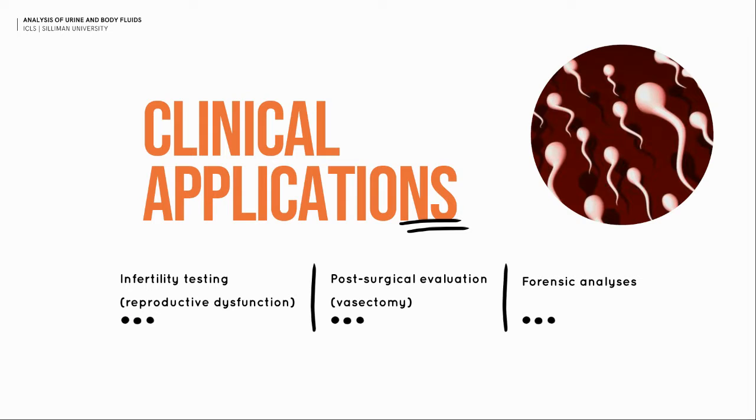So the first one, clinical applications. The first clinical application is infertility testing. This is for couples who want to conceive a child and want to test whether the male is capable of producing offspring, whether he is fertile, so they check the seminal fluid analysis for reproductive dysfunction. Also, it is for post-surgical evaluation of vasectomy.